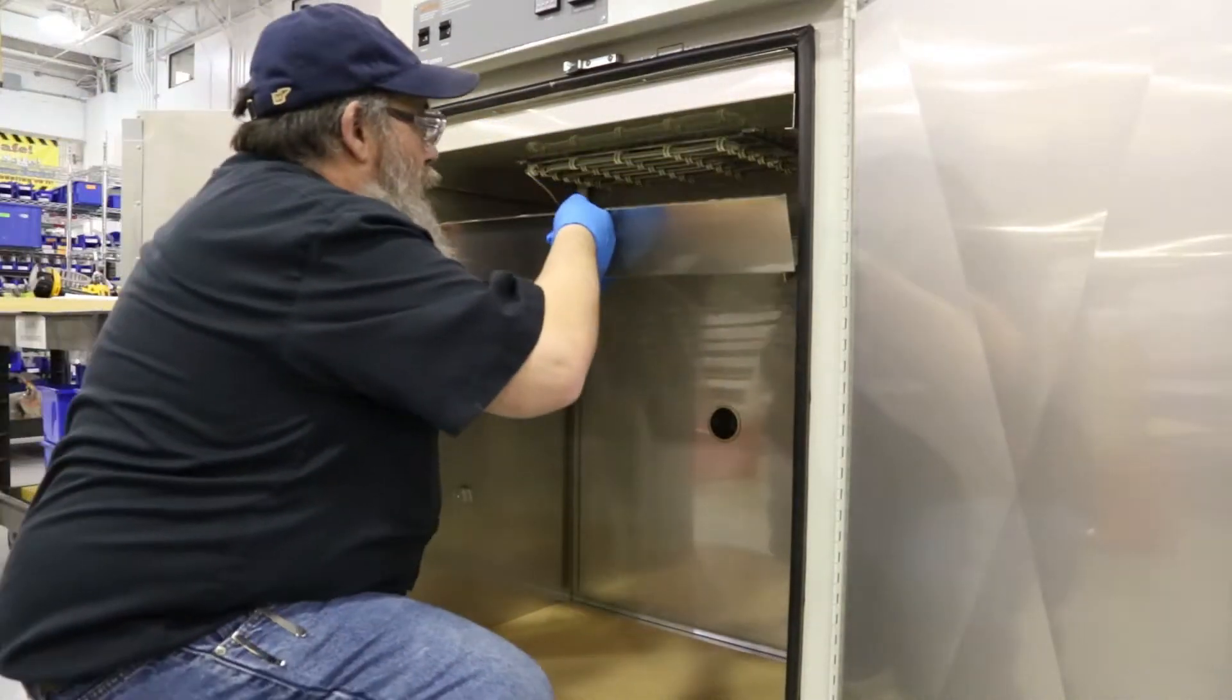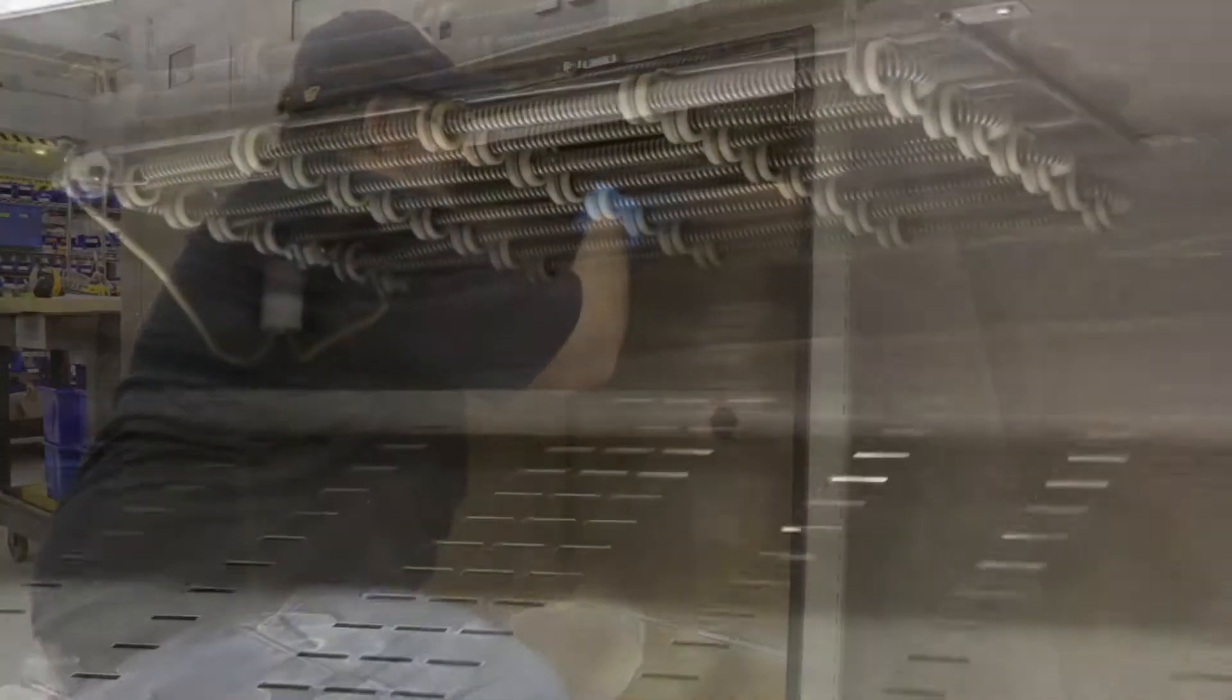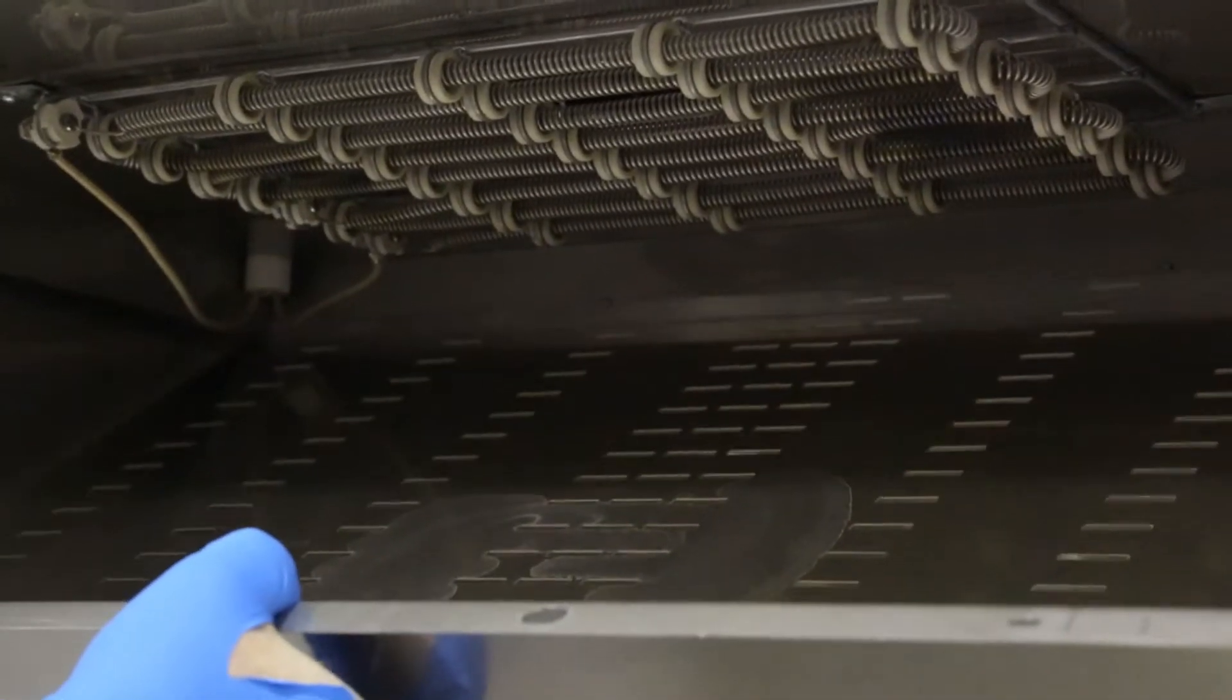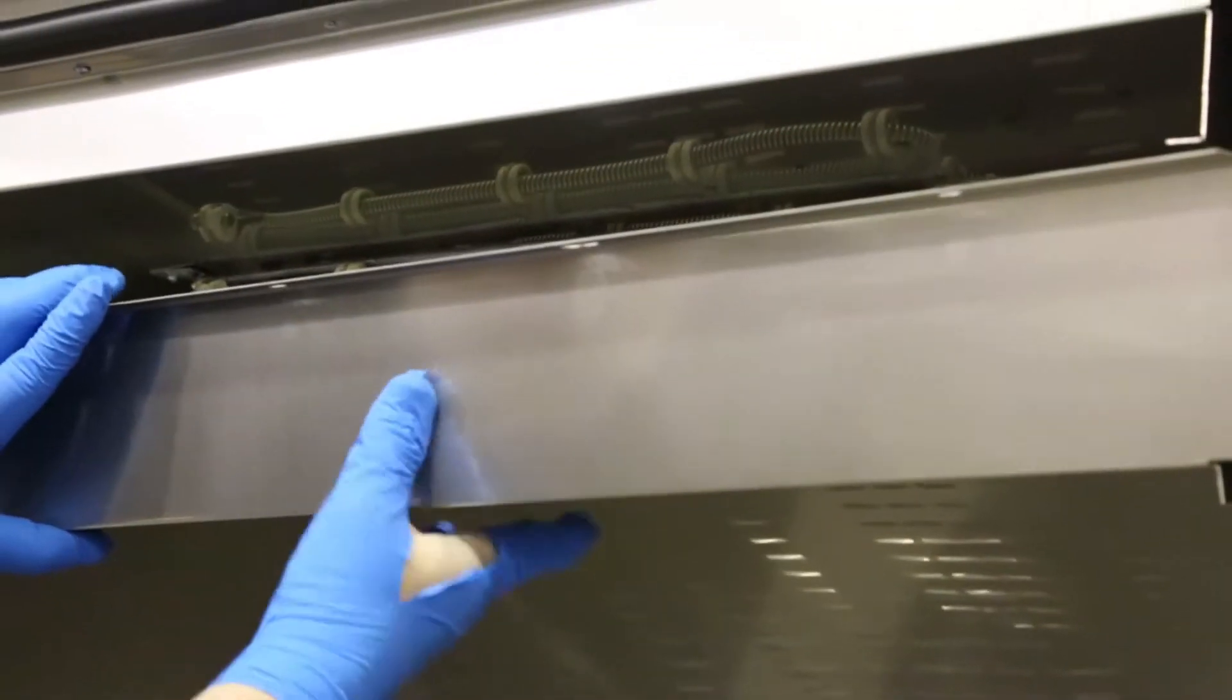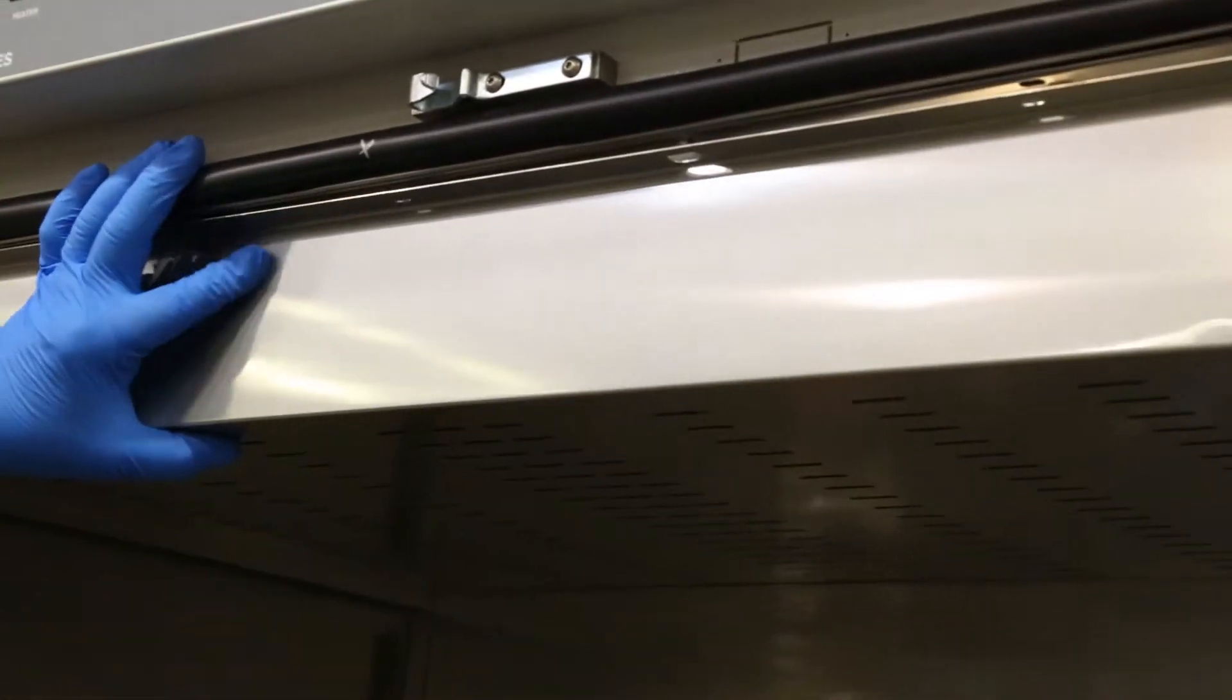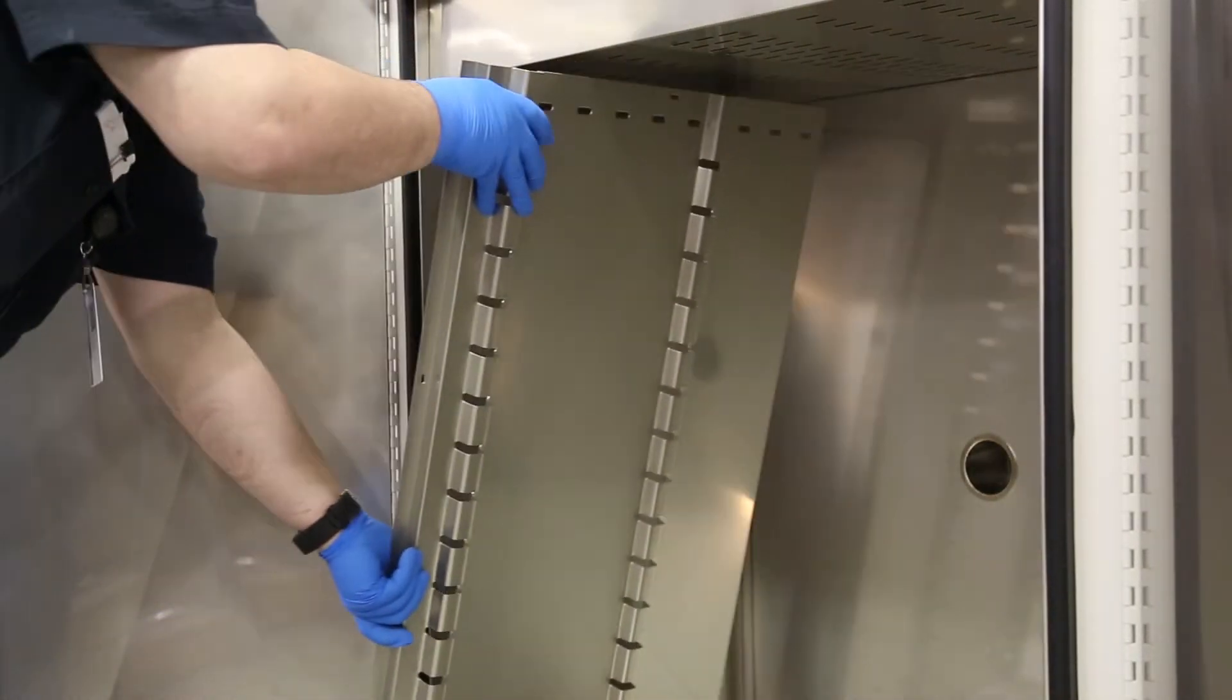When replacing the heater cover, be sure to set the back panel into the back channel. And then replace the three screws on the front. Replace the side panels and you're finished.